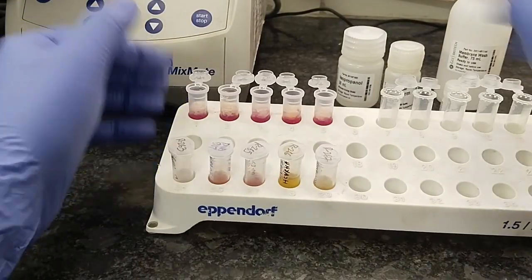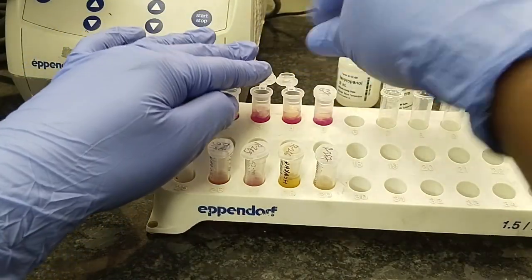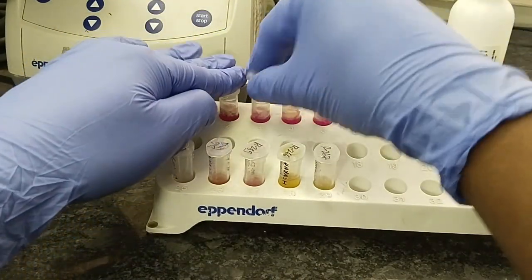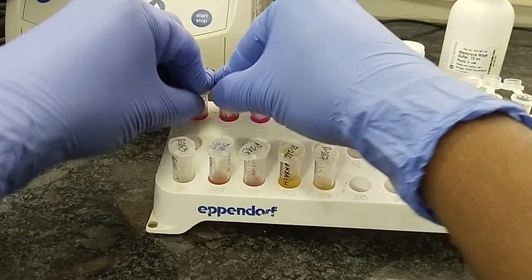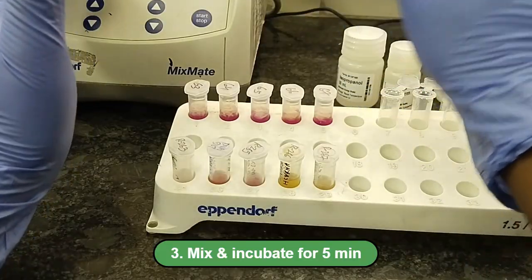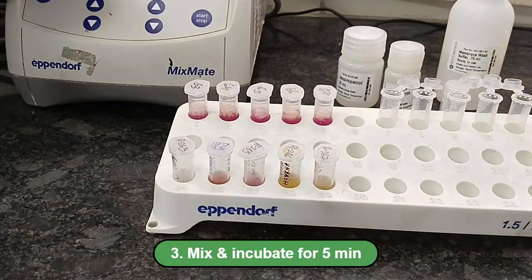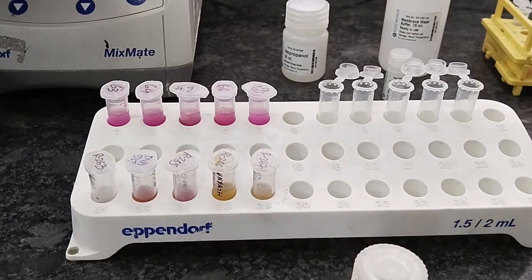Now we need to incubate the tube. Close the lids of the microcentrifuge tube. Then we have to incubate the tube at room temperature for 5 minutes. Incubation for 5 minutes at room temperature is over. Let's move to the next step.